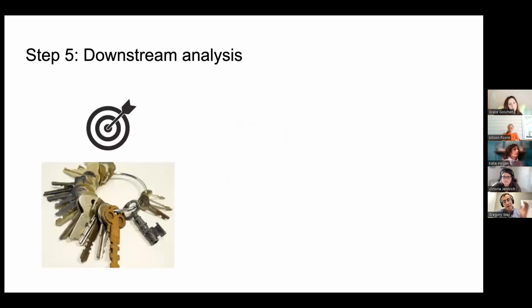So this is now butting up against what's currently thought and state of the art. But really, we like to think of compounds not necessarily as targeting one very specific thing. It's going to do a lot more in a cell than maybe we anticipate, and certainly going to do more in a cell in vivo than it is in a dish. But we want to essentially let the data do the talking. And so thinking about a compound more as a set of keys that might unlock different doors in different contexts is probably a better analogy than thinking of precision medicine, of looking at an arrow that's going to target right in the middle of that bullseye.